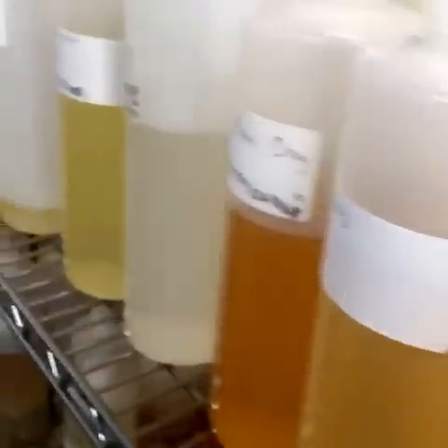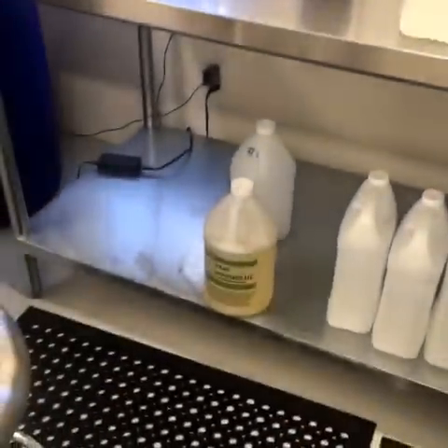Okay. And where's the nicotine kept? The current bottle being used is down there, the rest is kept in a refrigerator out here.